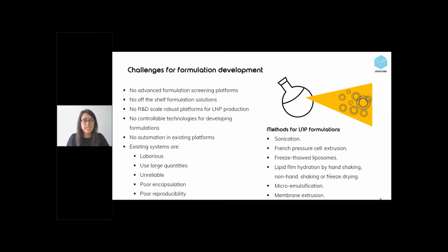We're talking milliliters to liters. So there's a lot of wastage that comes out of that. They are unreliable. They offer poor encapsulation, and there's hardly any control on how you can manipulate some of the parameters, and they have poor reproducibility because of their batch-to-batch process. So there are various different challenges that we face with current and existing platforms for lipid nanoparticle productions.